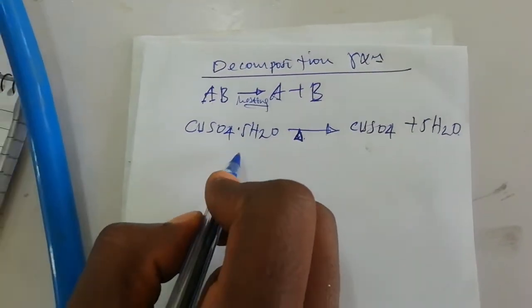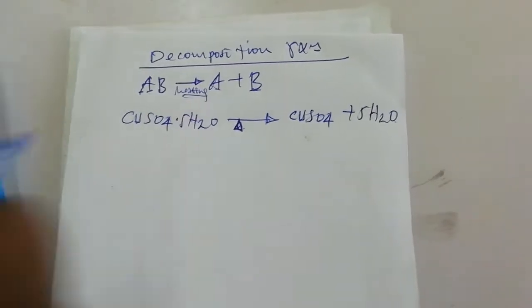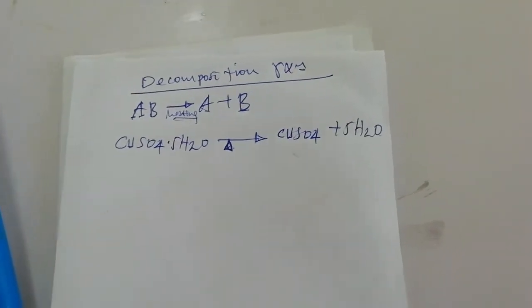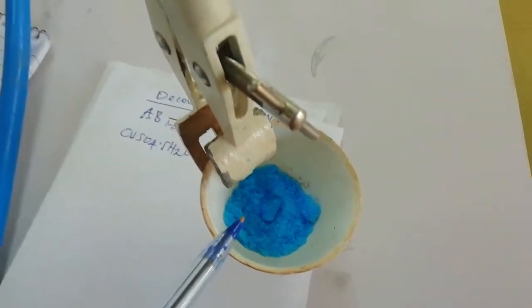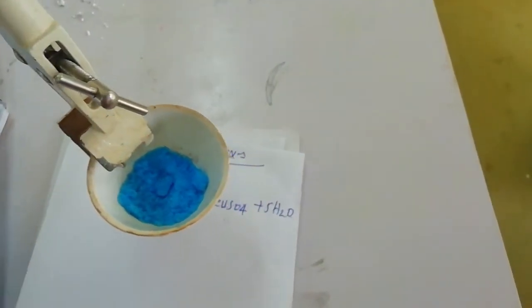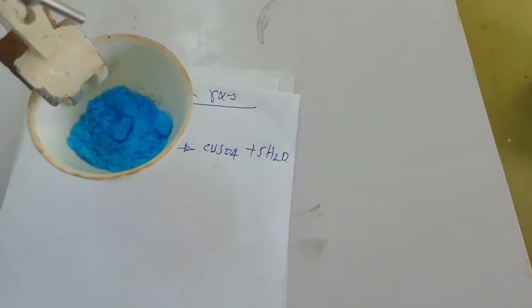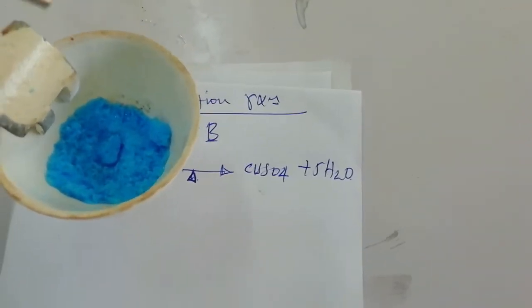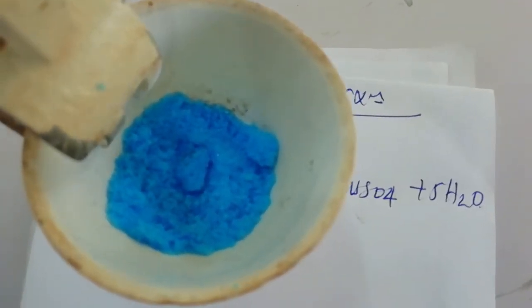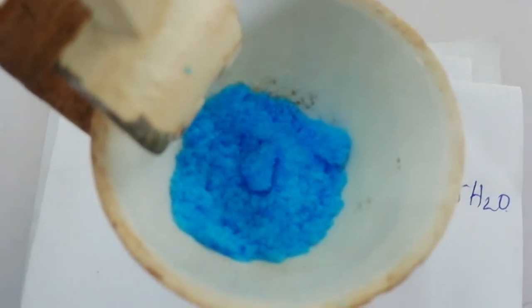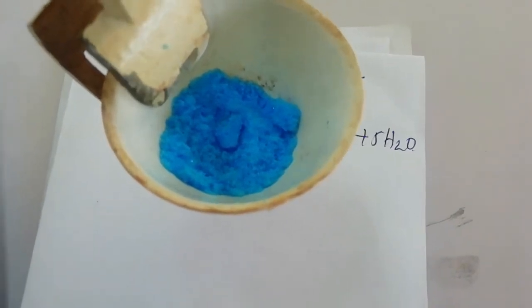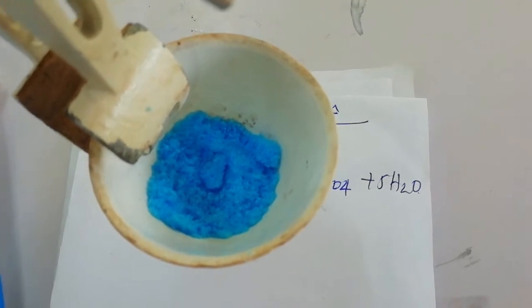Copper sulfate pentahydrate takes the form of a blue color. This is copper sulfate pentahydrate, which is a blue color crystal. Upon heating, it loses its water of crystallization and decomposes into a white powder, which is anhydrous copper sulfate. Anhydrous copper sulfate means copper sulfate with no water, since the water vapors from it upon heating.